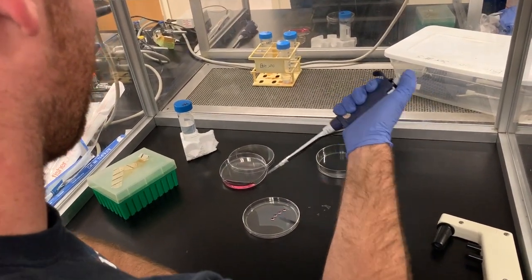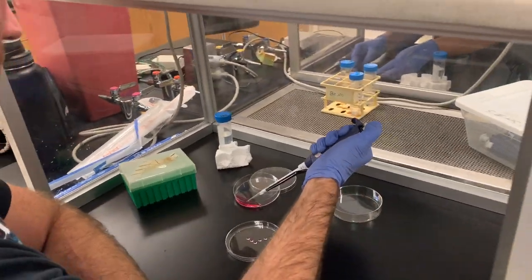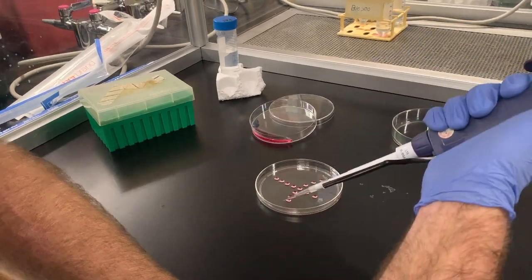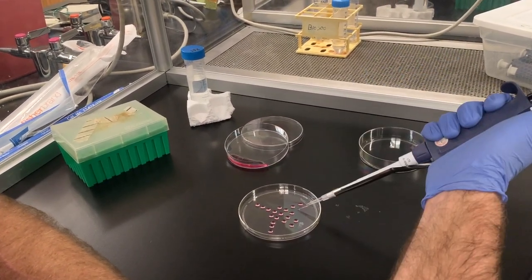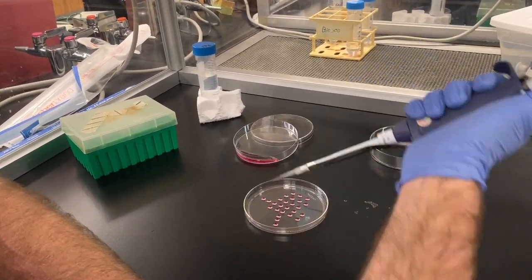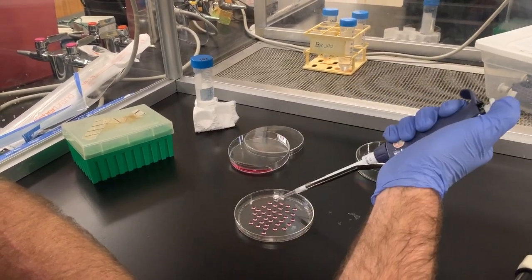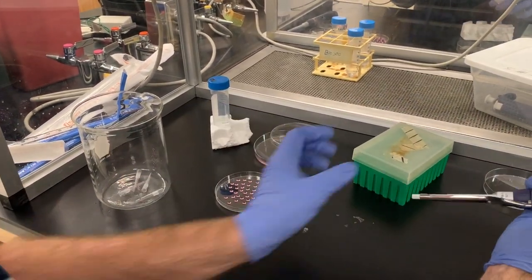Set your pipette to 27 microliters and place as many drops on the lid of the petri dish. If your pipette tip happens to touch the lid of the petri dish or any other area, be sure to change pipette tips to avoid contamination.